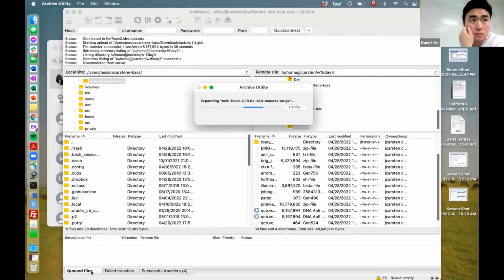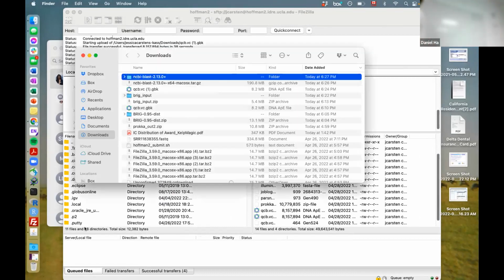Which BLAST is it that we use? Which BLAST? Yeah, look at the bin. I closed it from yesterday. So I still have it down. Okay, sure. I don't remember. Oh, you don't have to. We already set that up yesterday. Just set the path up to the bin. So, download. Oh, so up to here. Okay, I have selected. All right.